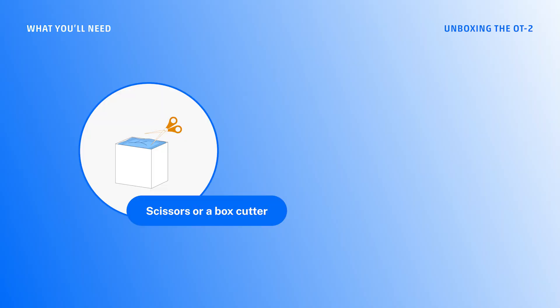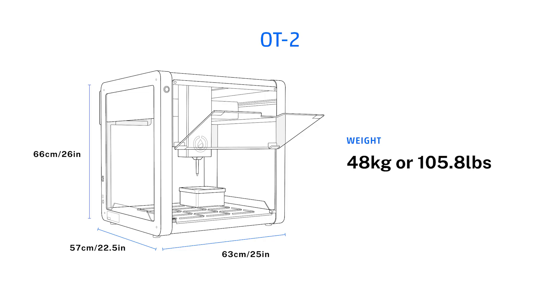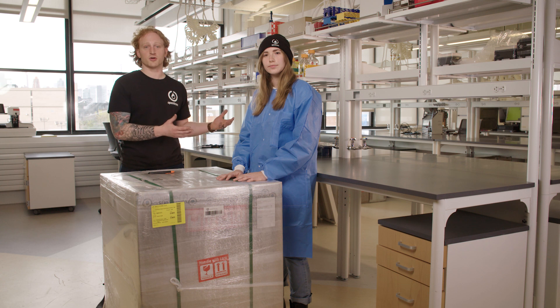First I'm going to do a quick overview of the materials I need to unbox the OT2. For the unboxing, I will need box cutters, which are not included with the OT2, and a partner. The OT2 weighs 48 kilograms, or 106 pounds, so they will help me lift the OT2 out of the box and onto the workbench.